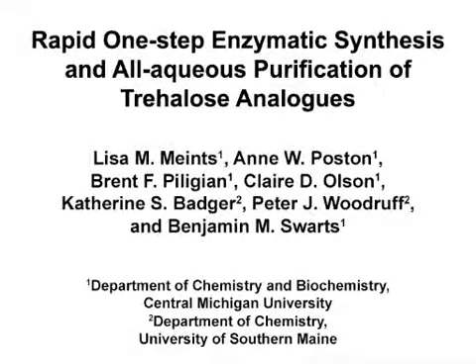The overall goal of this method is to rapidly synthesize and purify Trehalose analogues, which have possible applications ranging from the detection of pathogenic bacteria to the preservation of biomaterials. This is a fast and high-yielding method that provides access to analogues of the disaccharide Trehalose. These compounds have various established and emerging applications in biomedical and biotechnological research.